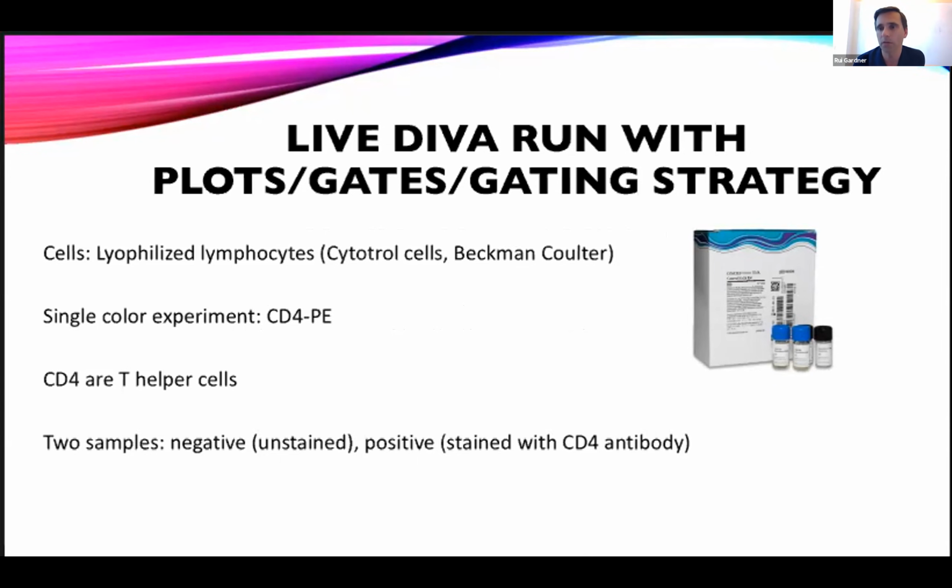To know if those target values are being met. Interestingly, as Rui said at the beginning, this is the first time we've done this, so it's as much of an exercise for us as it is for you guys. And obviously one of the things that's coming out here is that maybe we need to think more about explaining what CS&T does. But for the purposes of today, we're doing it because we're making sure that the machine is fit for purpose for the very simple experiment that we're going to do next.